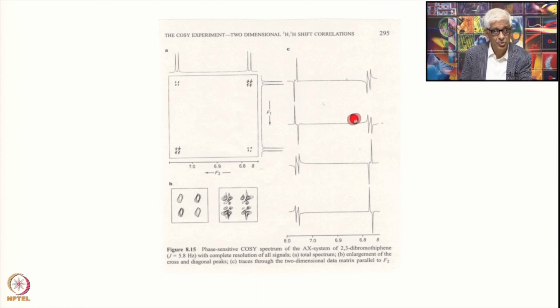And what do you see? You see here positive, negative. If this is positive, the next one is negative, or if this one is negative, the next one is positive. Kind of an antiphase term which I talked to you about earlier, and these are both absorptive signals. This is negative, positive, absorptive signals. You continue in this one, you come here, see here, these are dispersive signals. These dispersive signals go like this, and then the other one again goes like this. Therefore these are in phase. So if I want to write here, these are in phase dispersive.